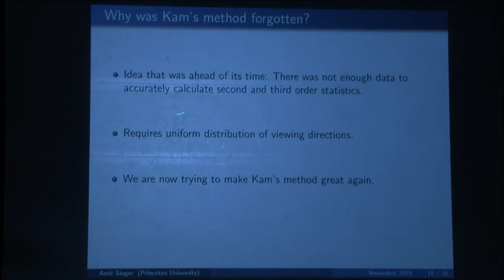And also there is the requirement that the distribution must be uniform. And like I mentioned before, in practice, this assumption is violated. So it's really nice in theory, but in practice, it doesn't work very well. So in my group now, we're actually trying to fix this part, that we need uniform viewing directions. And again, in the spirit of the elections, we're trying to make Kam's method great again.